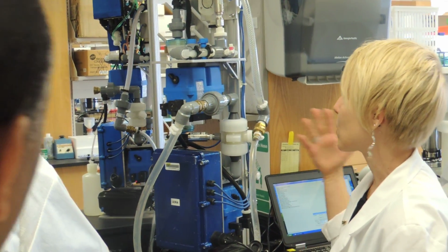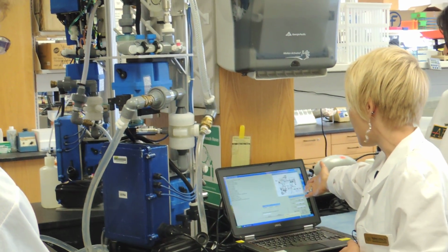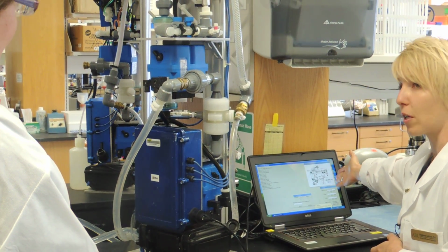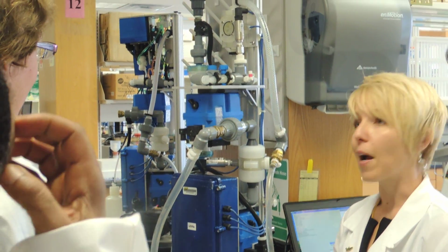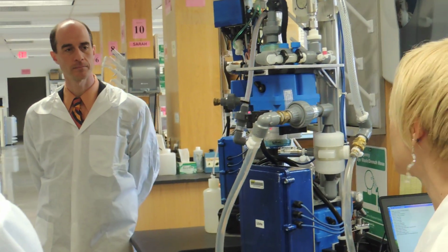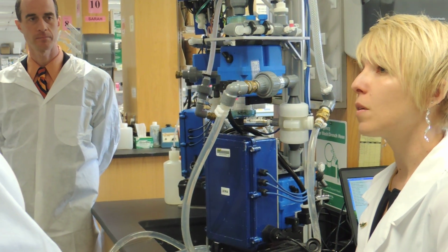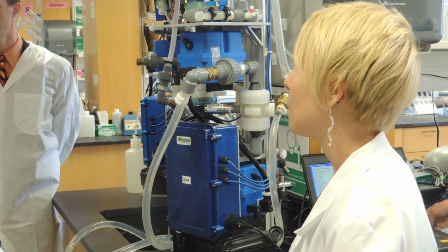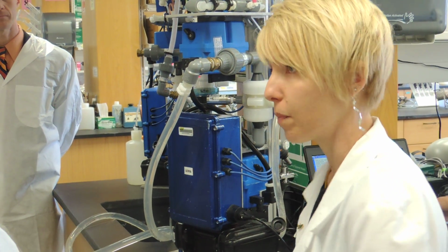So as all of the salts and water are just flowing back through the other end of the filter, you'll notice that you start to see the total volume of the water that has been processed through the filter starting to increase, so that you can determine if this is a very clean water, such as we did with the aquifer. 500 liters of water we were suspecting was probably going to be required in order to get anything detectable. If you're using a very dirty water, such as some of the rivers that we've gone to, we typically do 100 because that's a good log scale up from the standard technology, but you can do a much lesser volume if you have a very, very dirty water, like a wastewater, per se.